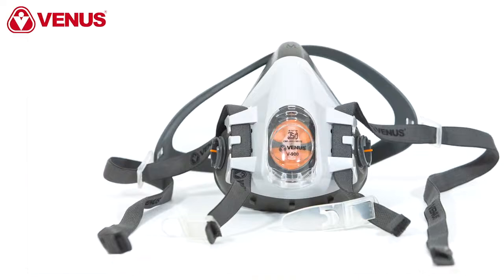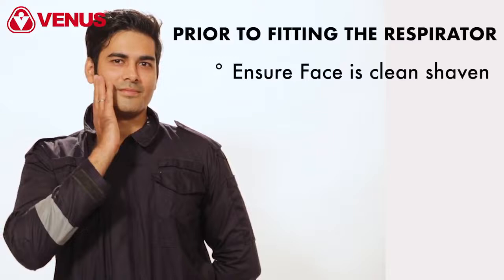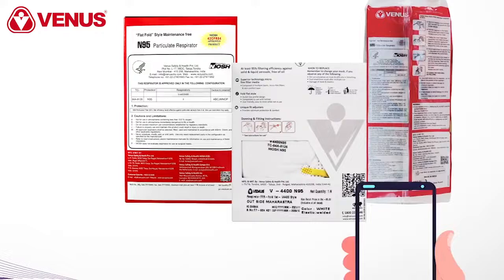Hello and welcome to this video demonstration of how to correctly fit the Venus V900 series reusable respirators. Prior to fitting the respirator, make sure that your face is clean shaven. These respirators should not be worn with facial hair under the face seal. If you have long hair, make sure that it is tied back.